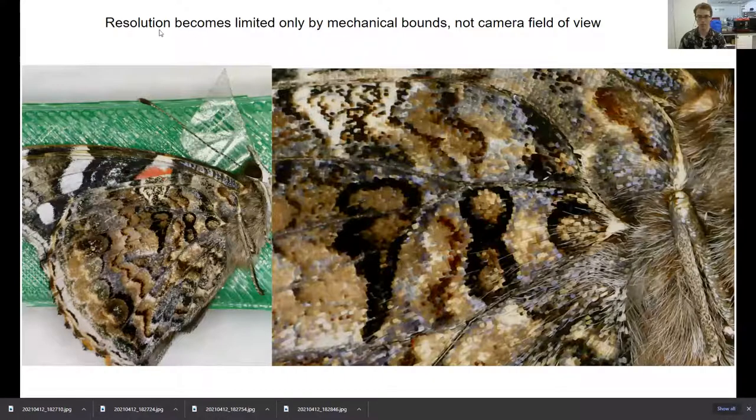Here's an example image using just this two-axis setup. Here is a whole butterfly that I literally placed onto a stage — I used a little bit of tape to keep it steady — and scanned the whole surface. This whole surface is about 30 or 40 megapixels. The original pictures I used to put it together were 0.3 megapixels — a very, very low resolution camera. But you can see pretty good detail: the scales, the hair. You basically get the maximum magnification of this cheap microscope over a large field of view, and that field of view becomes unlimited — constrained only by your mechanical bounds, not at all by the camera's field of view itself.